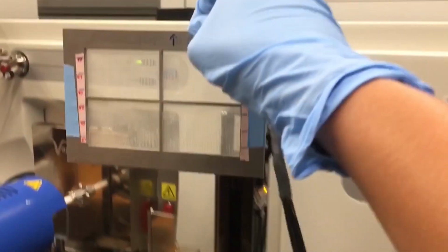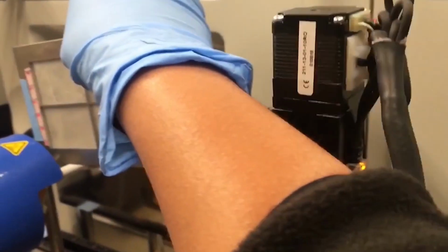The team also has some other interesting ideas for the technique, such as sticking a mesh inside someone's mouth to look at the volatiles in there. What we think we can do with SPMesh is actually make a... Did you see that? Yeah. So make a tongue print and do a SPMesh extraction off of the tongue print and see where volatiles are distributed in the mouth.